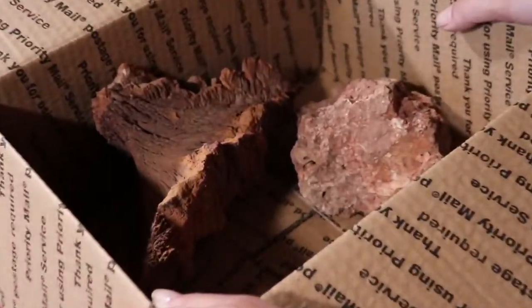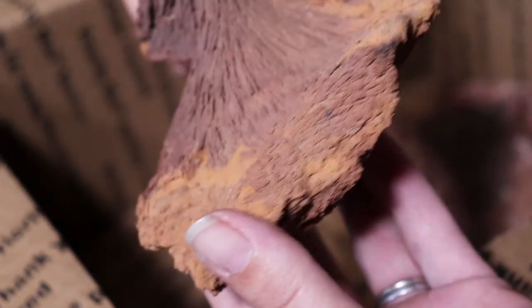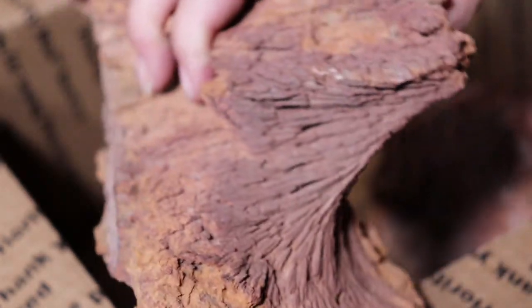This is pretty heavy. I bet it's the sample from Cornfield Power. This is definitely a fouling deposit, not molten like slags we typically see. And look, you can even see the impact of the gas flow. Mrs. Gill, I've seen this deposit before. I would like you to run to the sample cave and get the Longhorn 1987 deposit. Yes, we'll use it for comparison purposes.